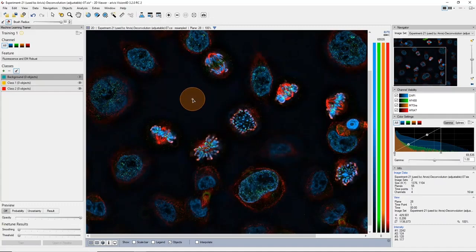And you don't need to know much about image analysis or the structure of intensity matrices to be able to do this, because this is kind of built into our brain from years of practice at detecting and recognizing objects.